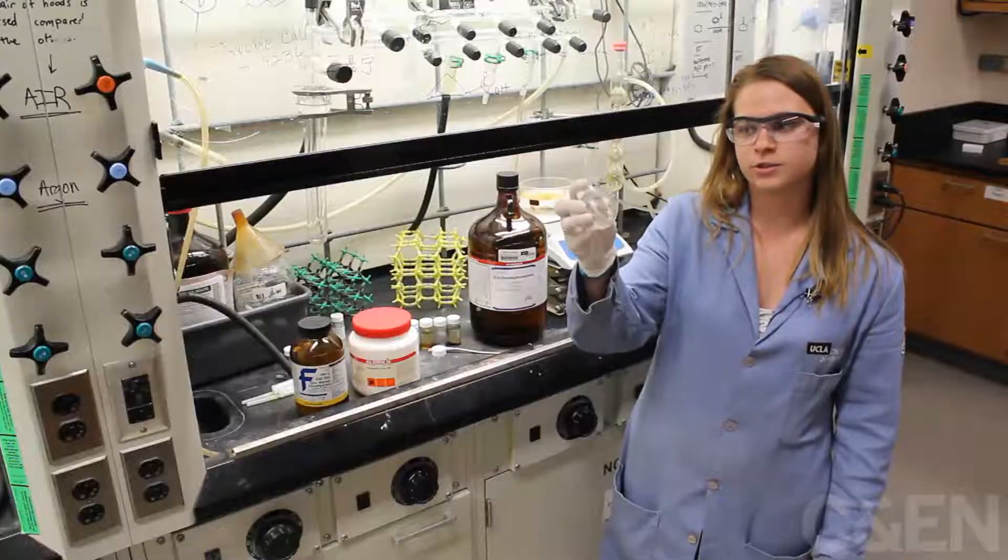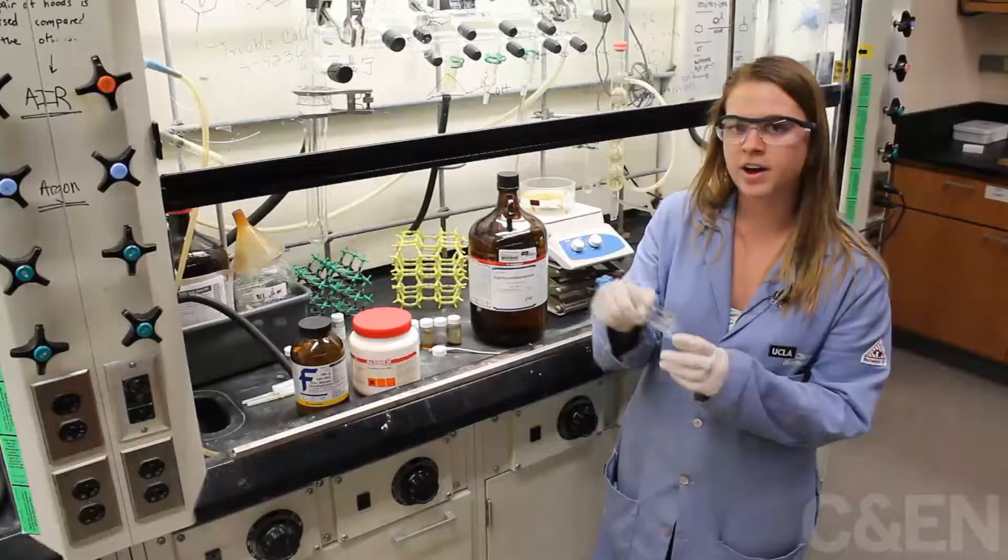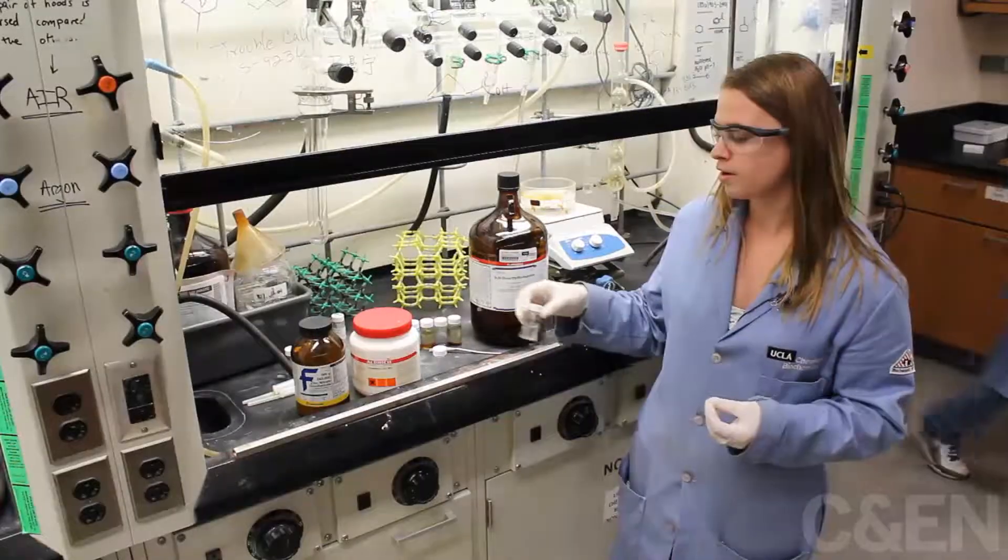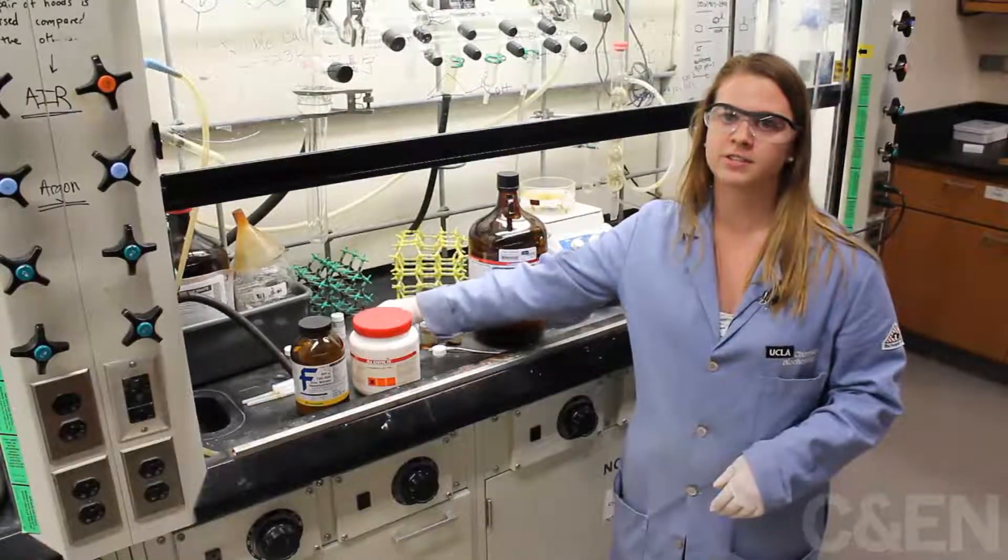So here's some synthesized crystals of MOF5. MOF5 is the most popular or the most well-known MOF. It was the first MOF synthesized in this lab.